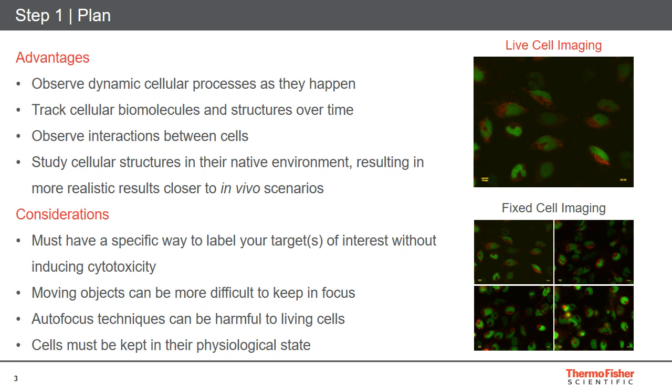So what are some of the main advantages of live cell imaging over fixed cell imaging? If we start at the very first step of the planning phase, where we're trying to build a foundation for our entire experiment, we should really sit down at first and determine what advantages we stand to gain from moving into live cell imaging versus the traditional fixed type of analysis.